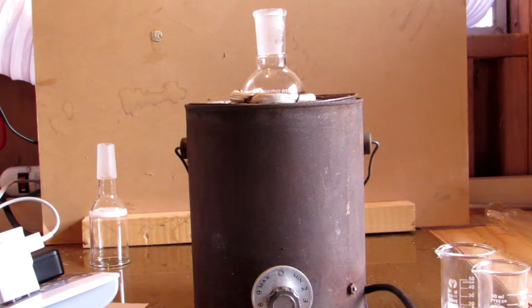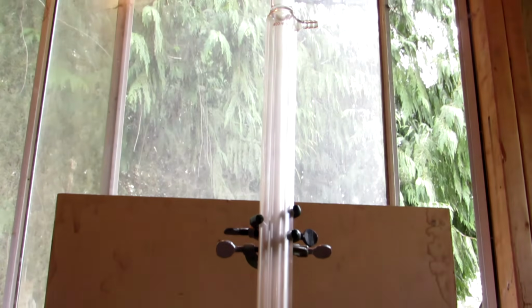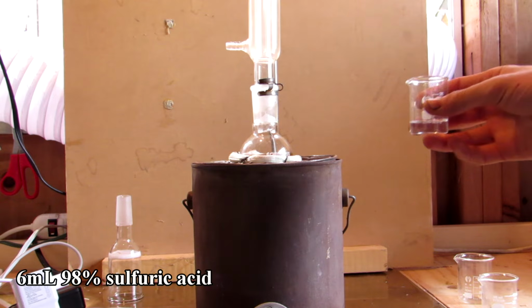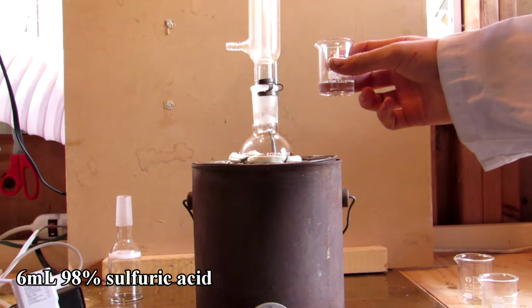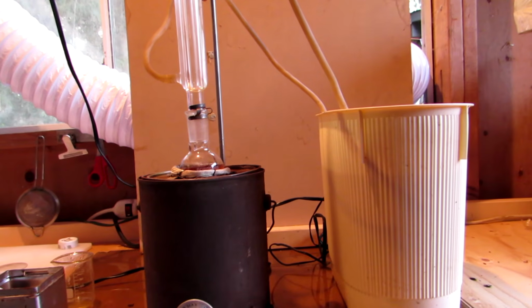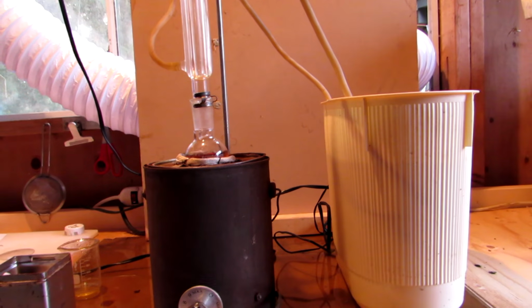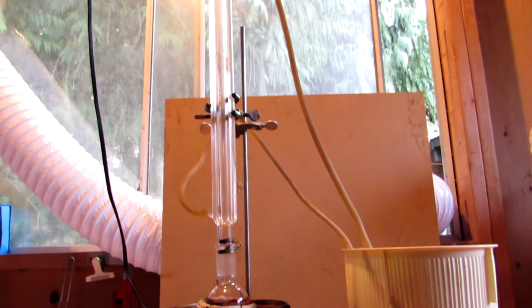However, in this case, a slight excess of acetic acid is used to hopefully react with all the ethanol and make it easier to purify the ethyl acetate later. After adding the acetic acid and ethanol, a condenser column is added on top, and then 6 milliliters of 98% concentrated sulfuric acid is poured in. I also show how to make the sulfuric acid in a previous video. Once the reagents are added to the apparatus, water is circulated through the condenser and the mixture is brought to a reflux using the heating mantle we designed in a previous project.